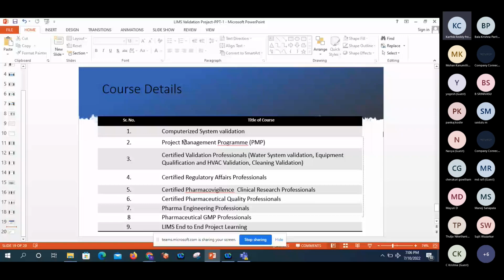Correct. Time synchronization validation should be properly assessed, otherwise this would happen. Whatever patches there are, time synchronization related information needs to be updated while doing the installation qualification. Those things we need to evaluate also during installation qualification. Okay, how to resolve it, sir?